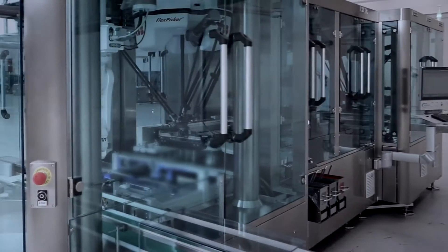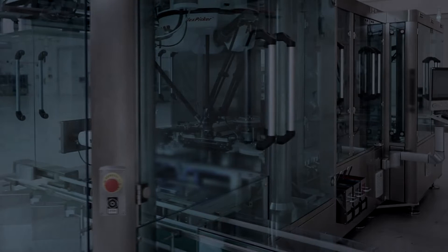Breveti Chea proudly presents the new K15DR machine, an integrated inspection solution for pre-filled syringes.